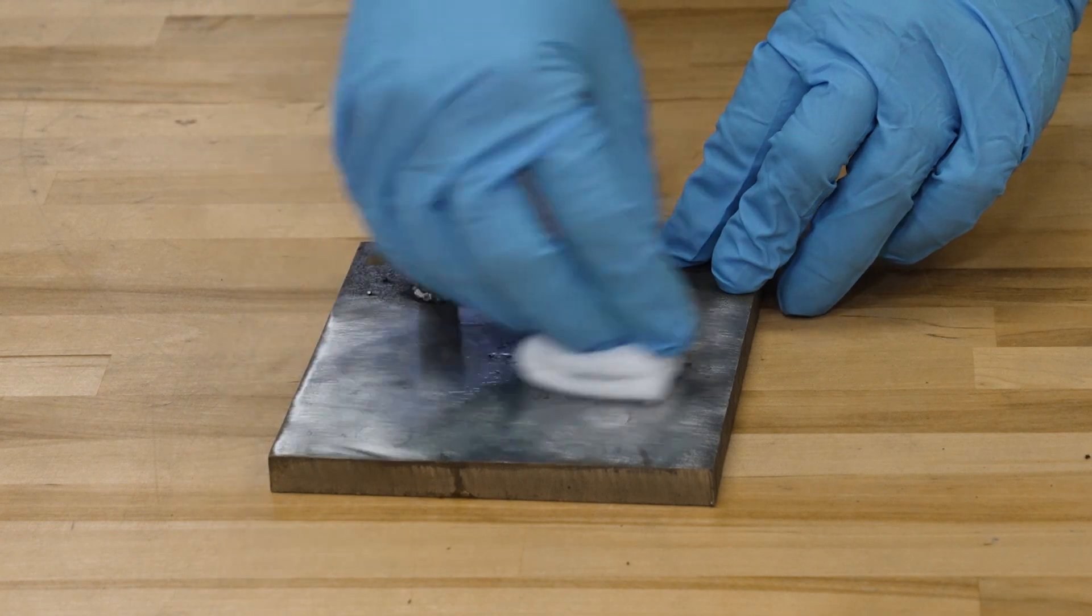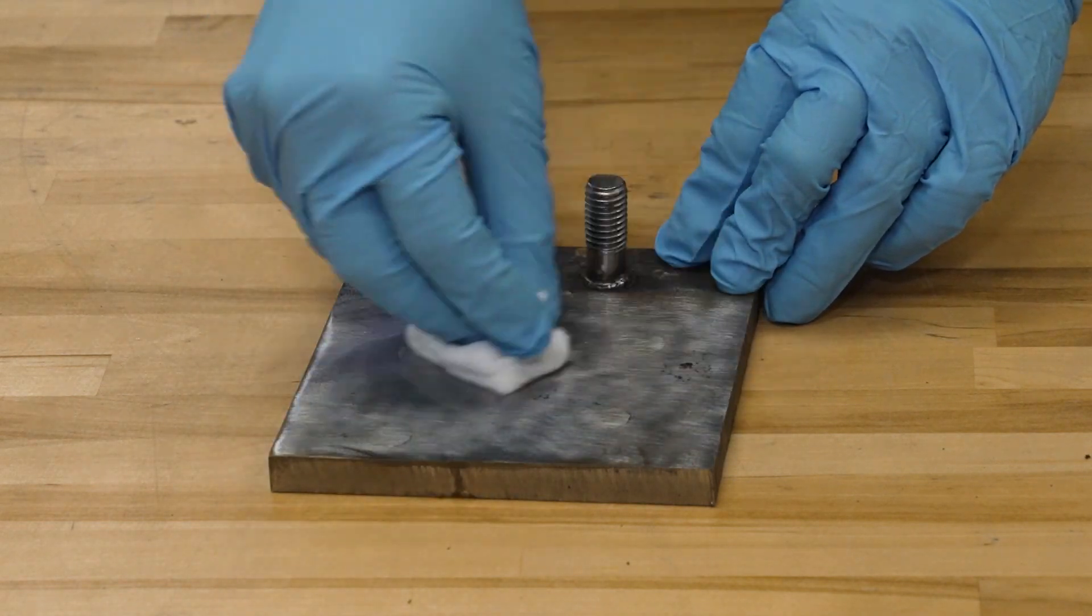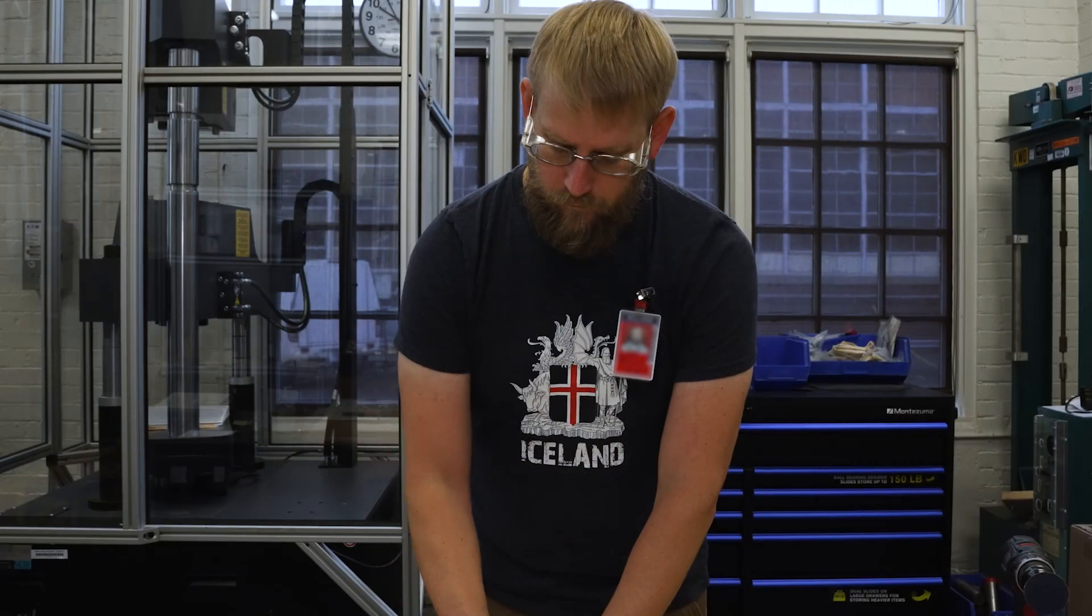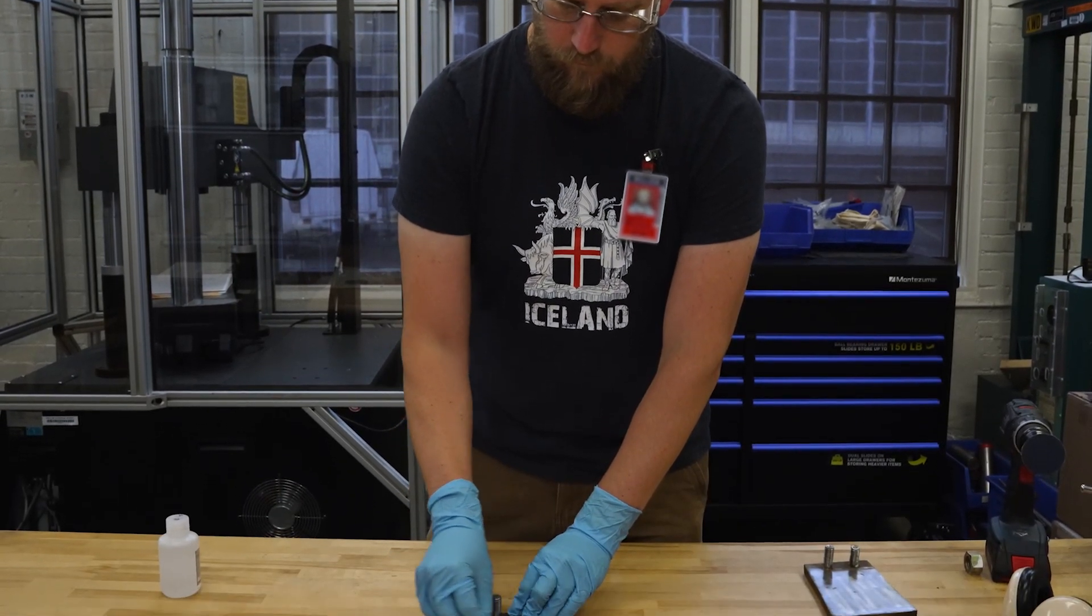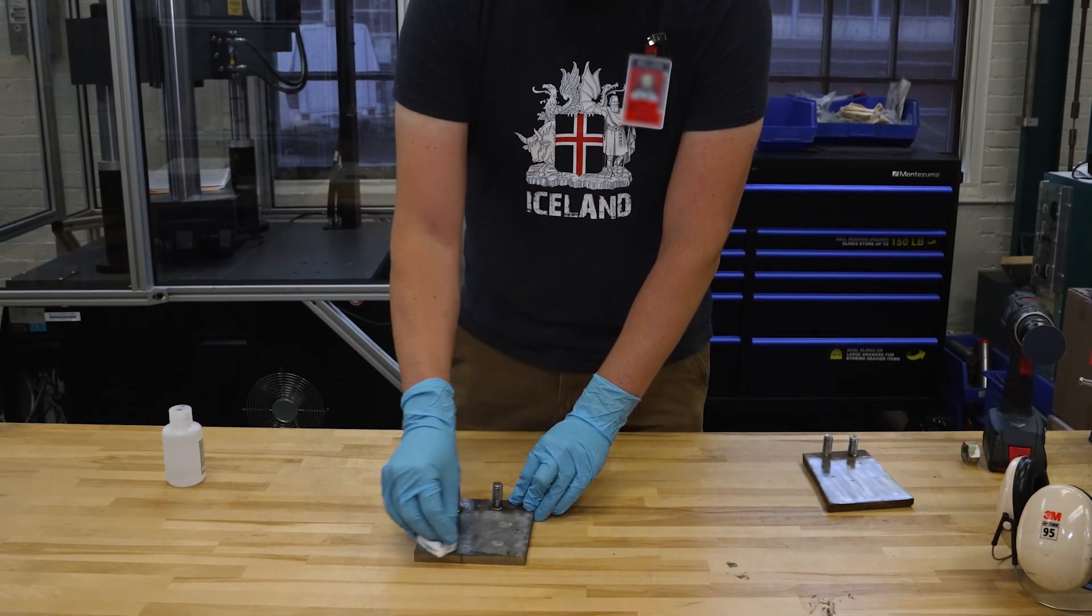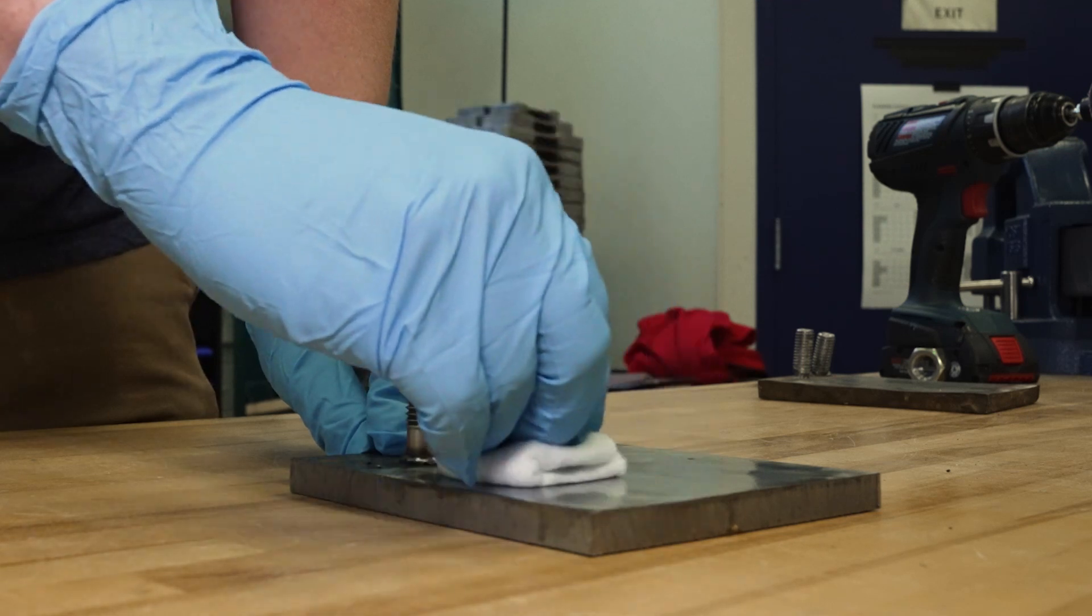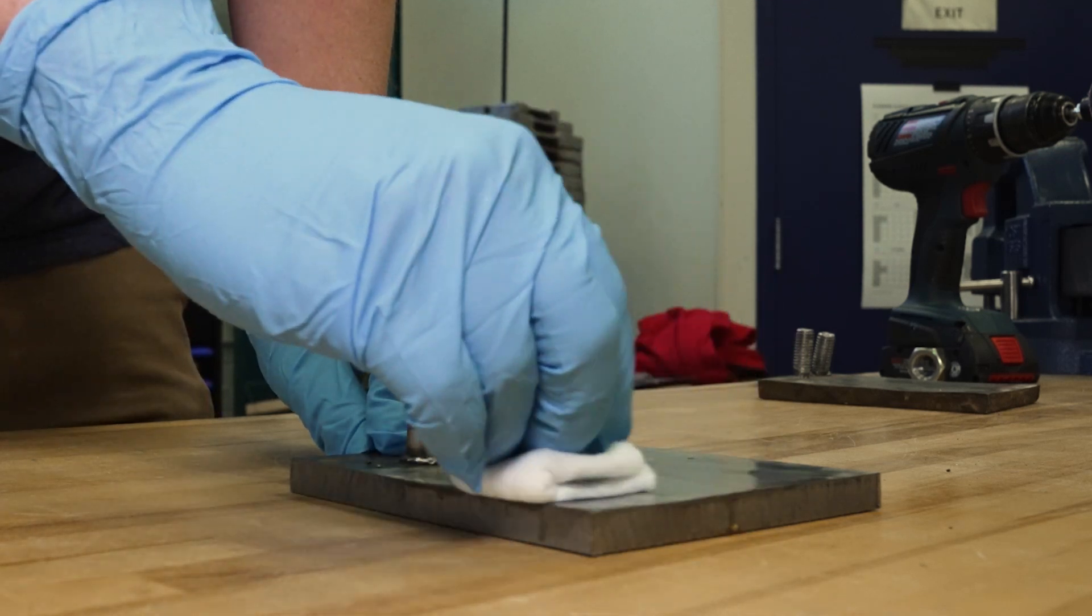Acid etching is conducted in the lab to reveal metallurgical features such as grain structure. On the waterfront, acid etching is used to expose weld features, as well as dissimilar metal boundaries such as stainless steel welded to high yield steel.